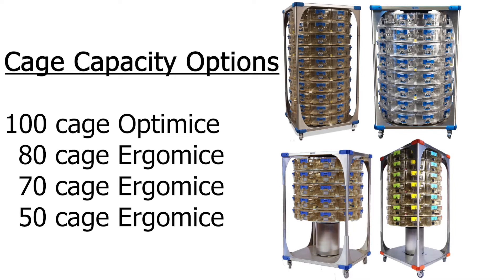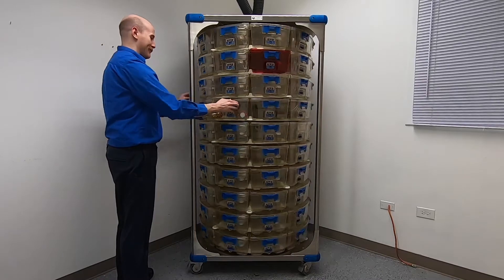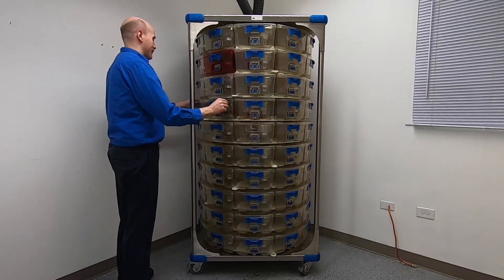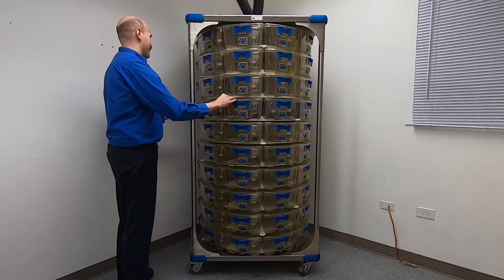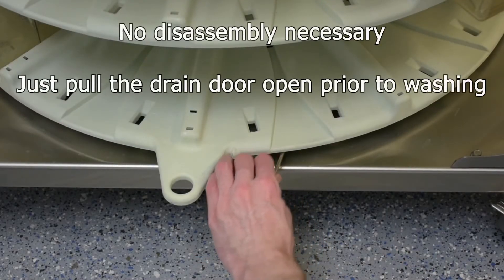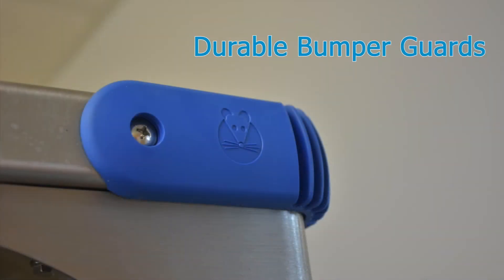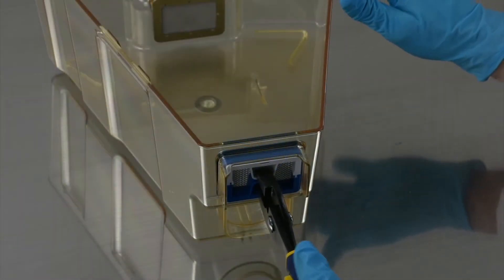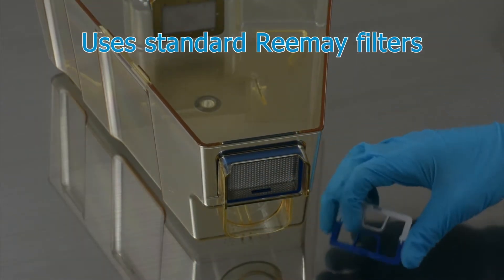The carousel rack comes available with four different capacity options. The carousel rack is more ergonomic — you can easily bring the cages to you. Standard HEPA filters are easily replaced when needed and are extremely cost-effective.